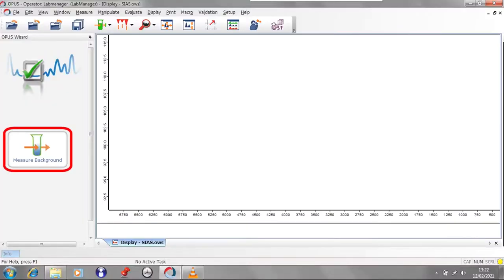Select Measure Background on the left-hand side of the screen. The program will run 10 scans of the background which will be averaged. This background reading will then be subtracted from the later sample measurements. Once the background measurements complete, the Measure Sample button will appear on the left and you can now move on to the sample analysis.